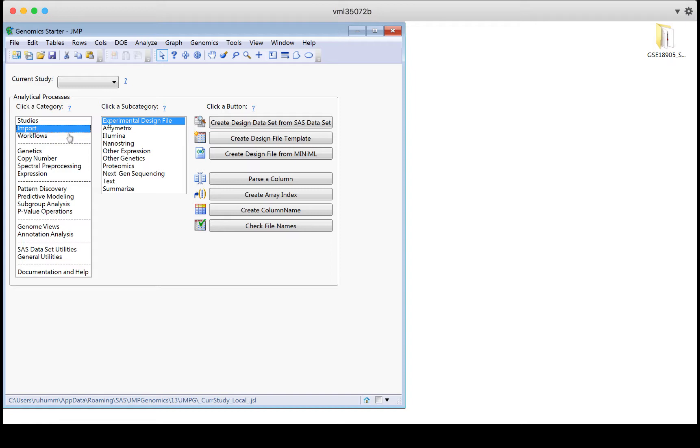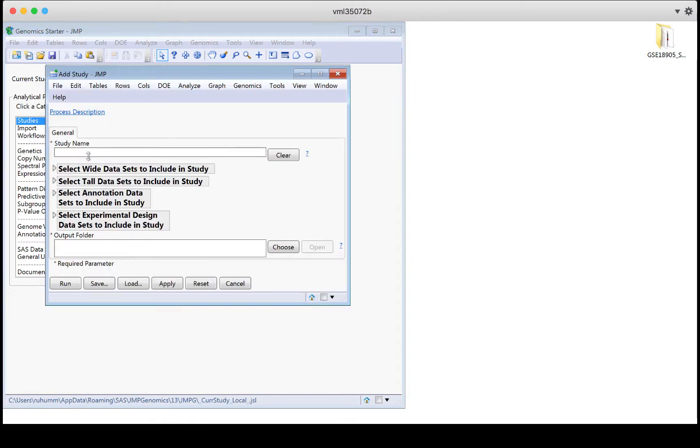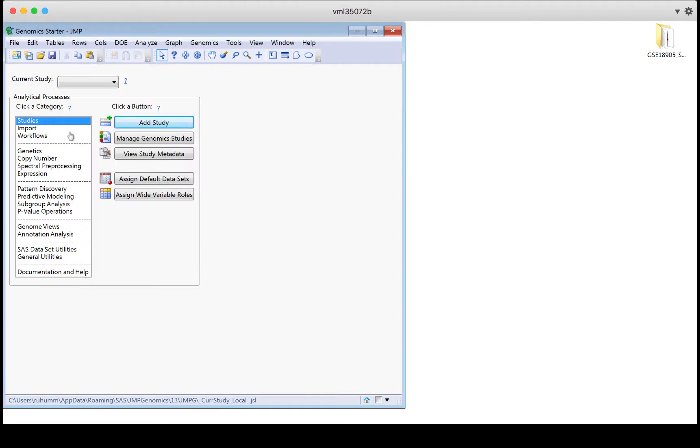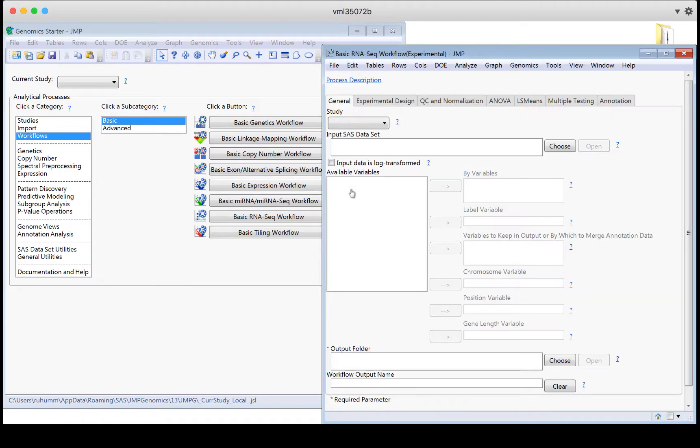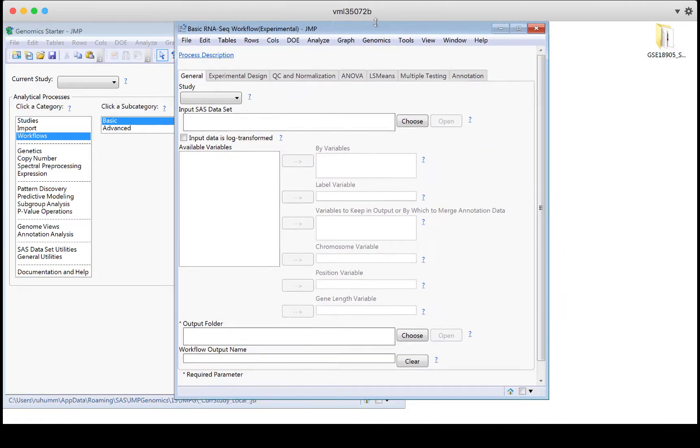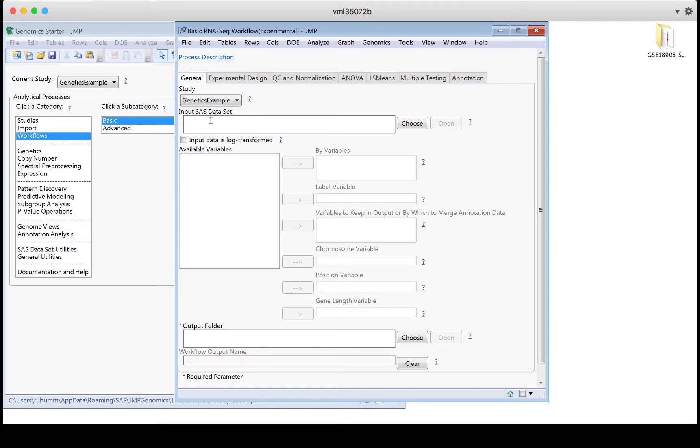Once you set up a study, add a study, look for the data sets that you want to add to it, and so on. Once you set up a study, then when you're using something like a workflow, and let's click on one here like the Basic RNA Seq workflow, if you've set up a study, you'd have a button at the top that would give you an example to choose.